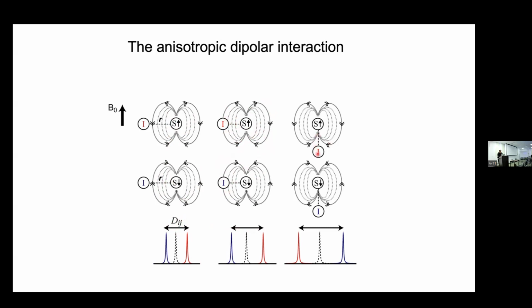And of course, if my molecule tumbles, the quantization of the spins always stays up and down, right? When you think of a vector rotating, it's doing this, so the quantization remains up. But now, of course, the nucleus finds itself in a place where it's enjoying double lobes, two magnetic fluxes coming together. So there's almost twice the amount of local field generated, and it's going the opposite direction relative to when it was here. Here it was being opposed. Now we suddenly find that it's reinforced and twice the magnitude.